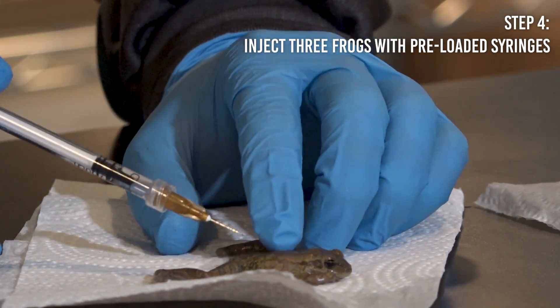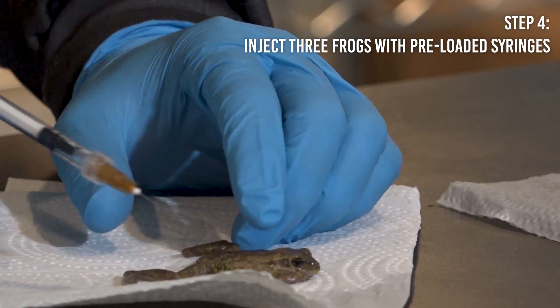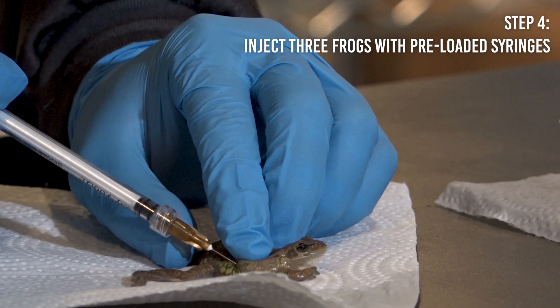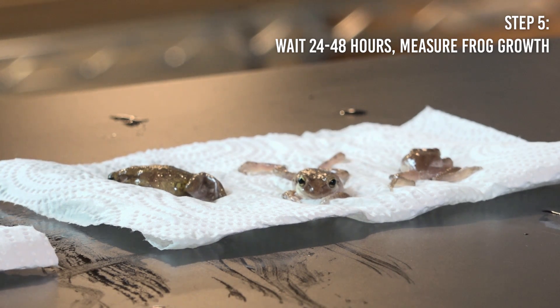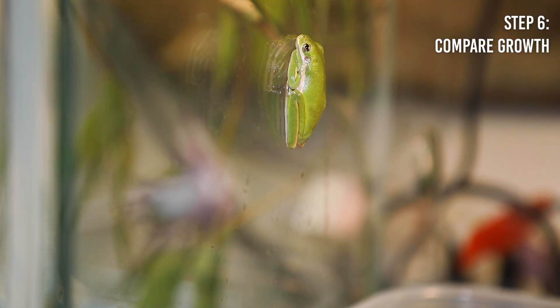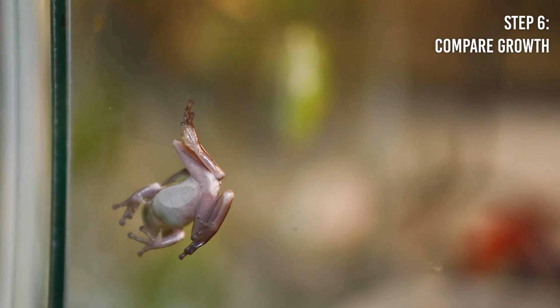Because these gene therapies are temporary, you see the maximal expression of the gene we put in there about 24 to 48 hours after it's injected. In the experiment, you inject the frogs once a week and see how their changes in muscle growth compare to the frogs that we did not inject.